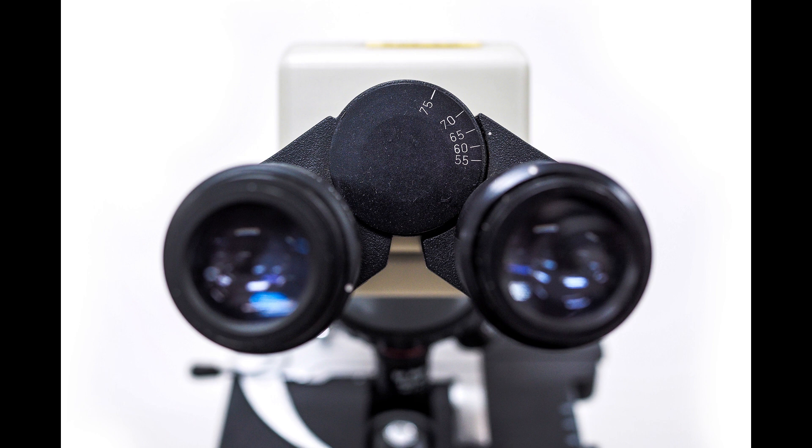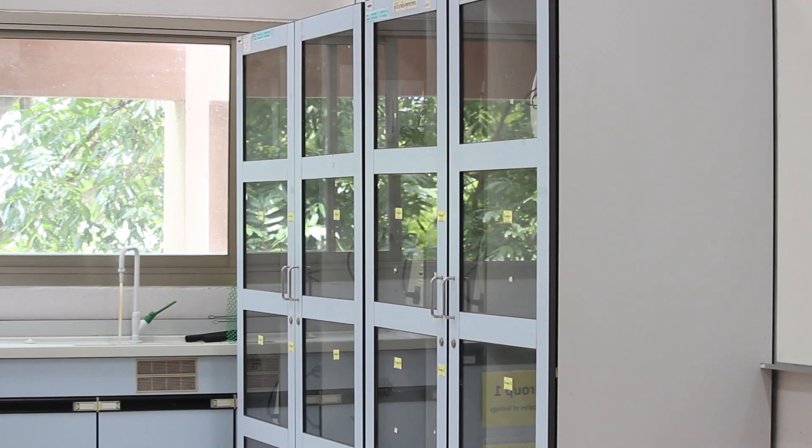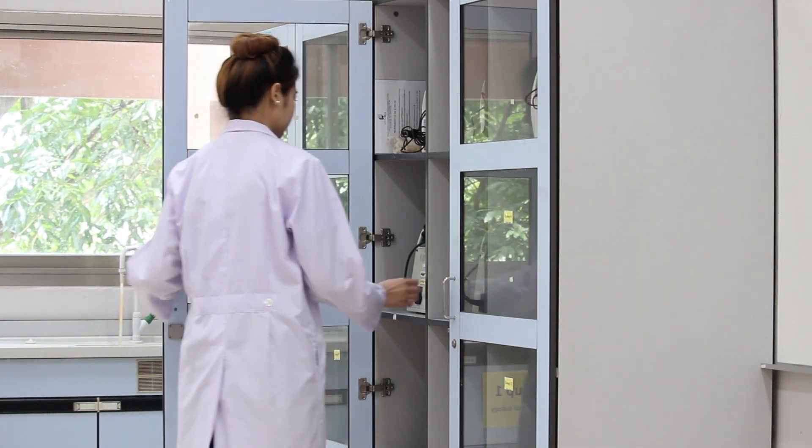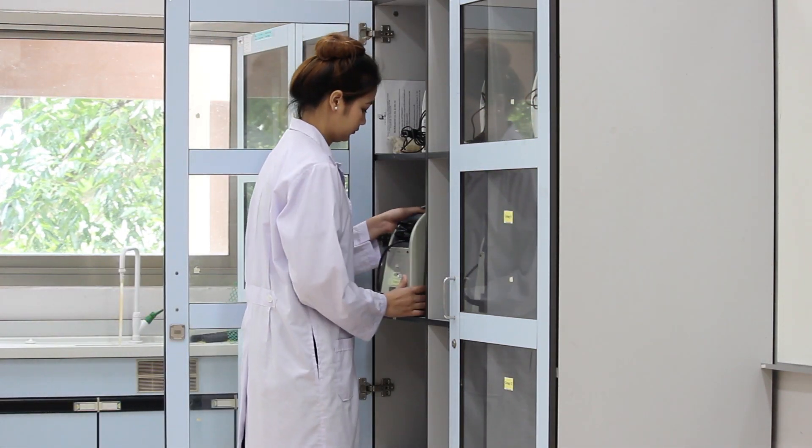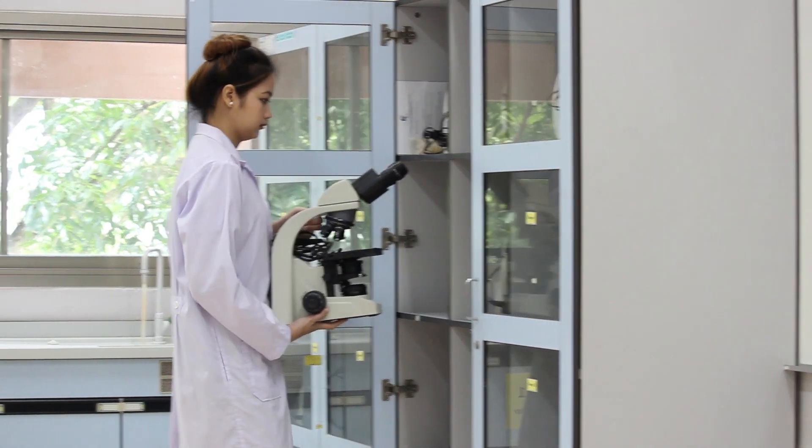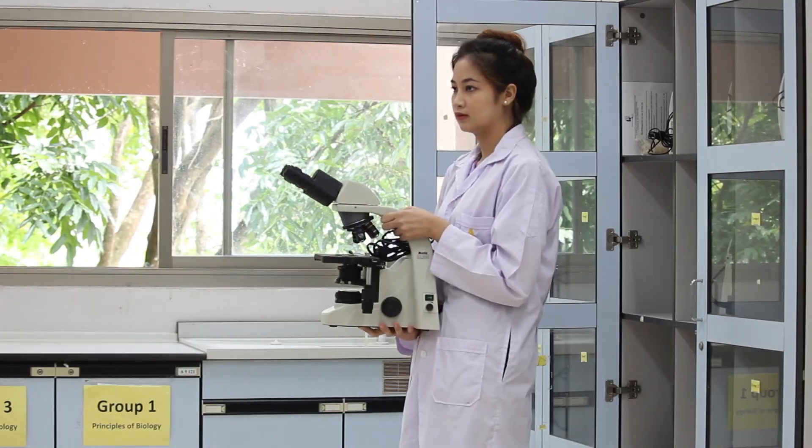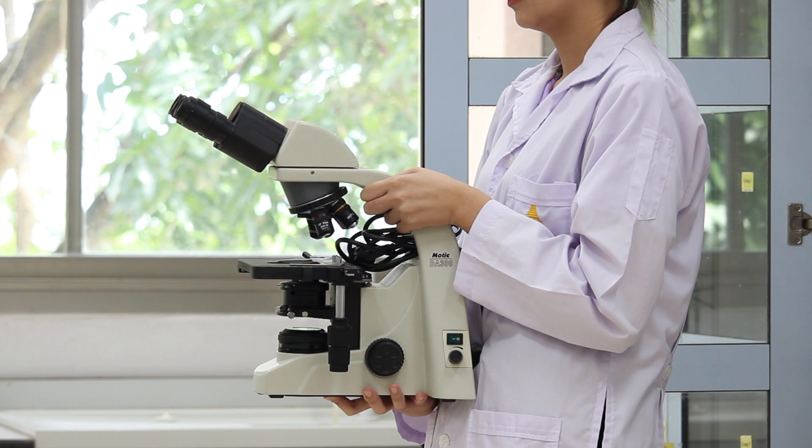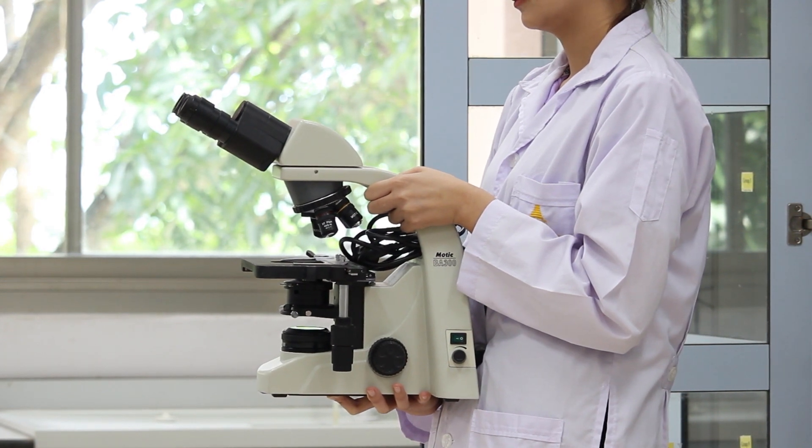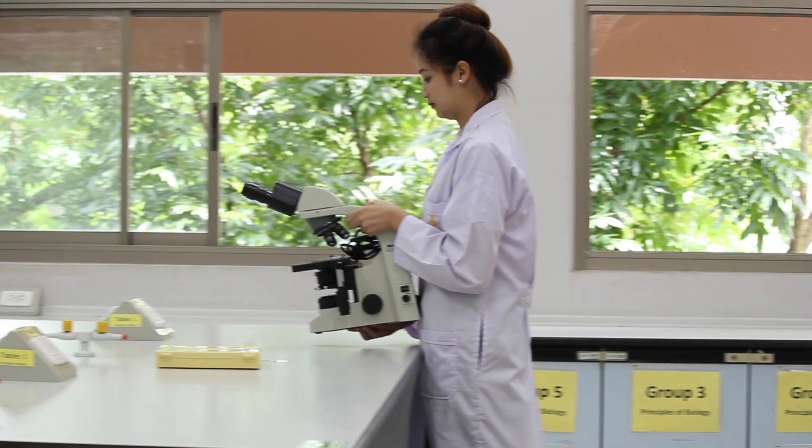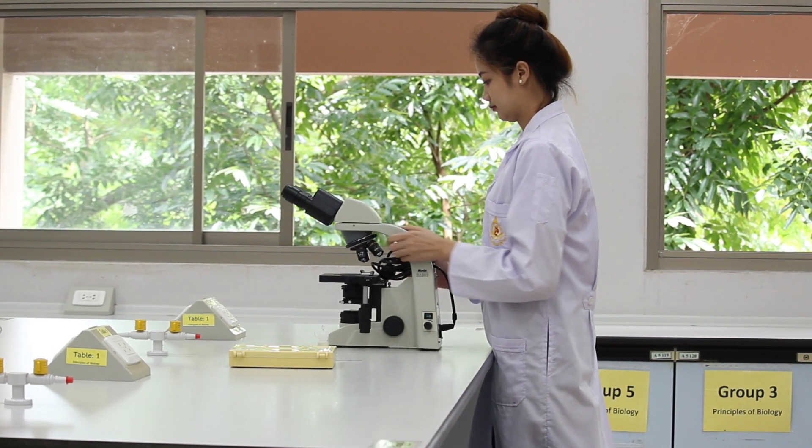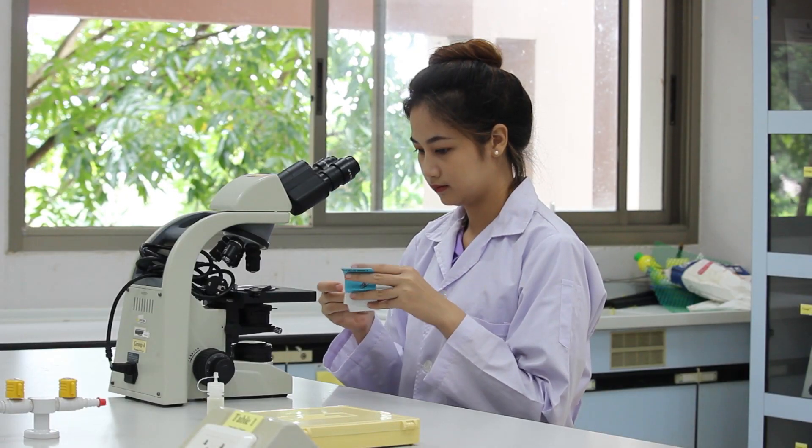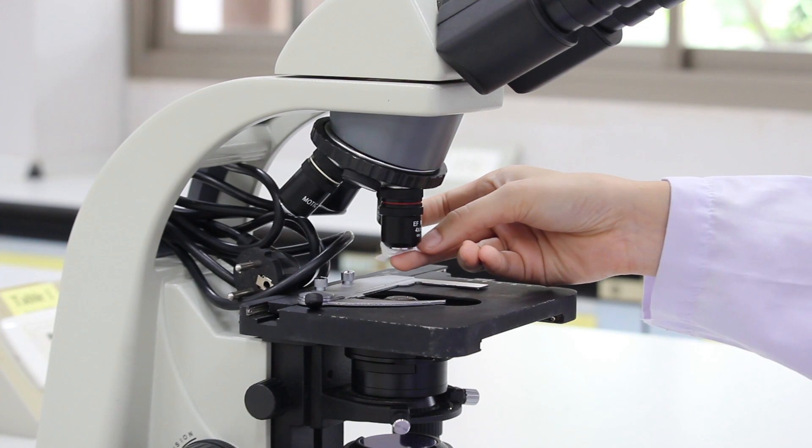Now, let's start with how to use the compound light microscope. First, carefully remove the microscope from its cabinet and carry it upright with one hand grasping the arm and your other hand supporting the microscope below its base. Then, place your microscope on the table. If it is necessary, clean the microscope's lenses with lens paper.